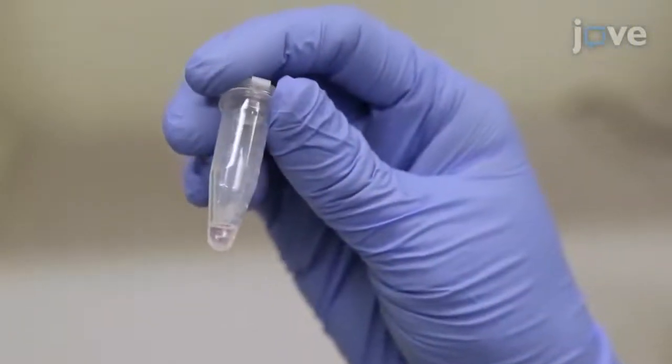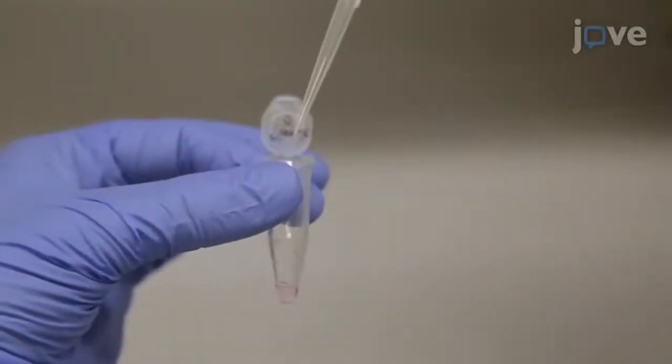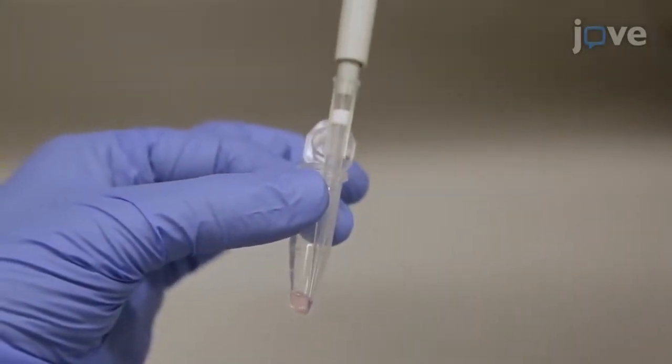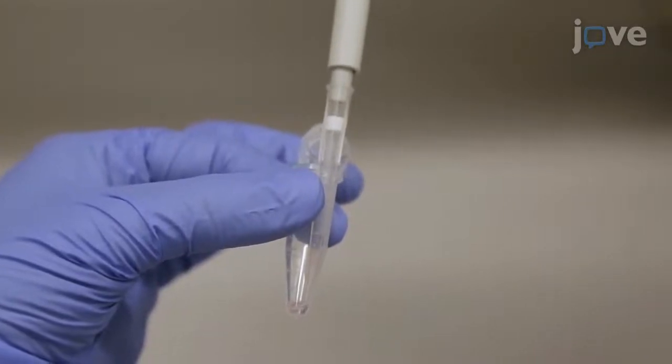Let the islets settle to the bottom of the microfuge tube. Then, use a pipette with a fresh P200 tip to carefully remove most of the supernatant, making sure to not remove any islets.